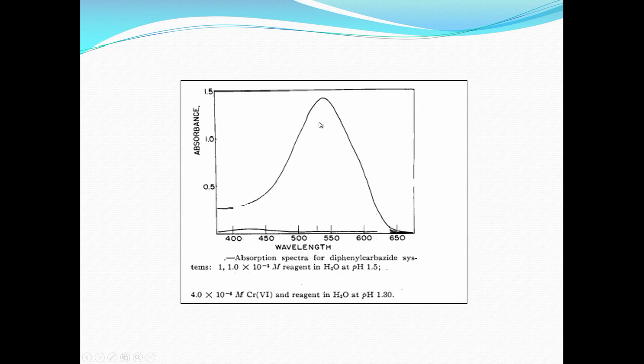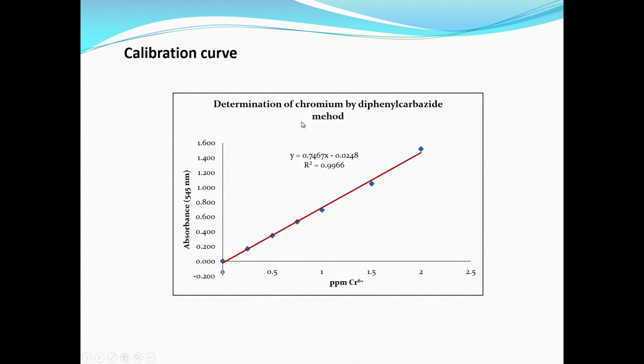For aluminum, we do not have any problem, up to 100 ppm we do not have any interference. So, the idea is you can determine chromium fairly confidently if you know the matrix components of the effluent. For drinking water, 0.05 is the limit, we do not have a choice, we have to determine the chromium content. I think I have already covered lambda max and the other aspects.